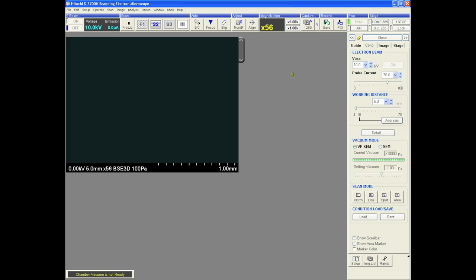Voltage ranges from 0 to 30 kV. Generally speaking, higher voltage gives better resolution and lower voltage gives better surface features. Lower voltage is best for non-conductive samples, while higher voltage is for conductive samples.